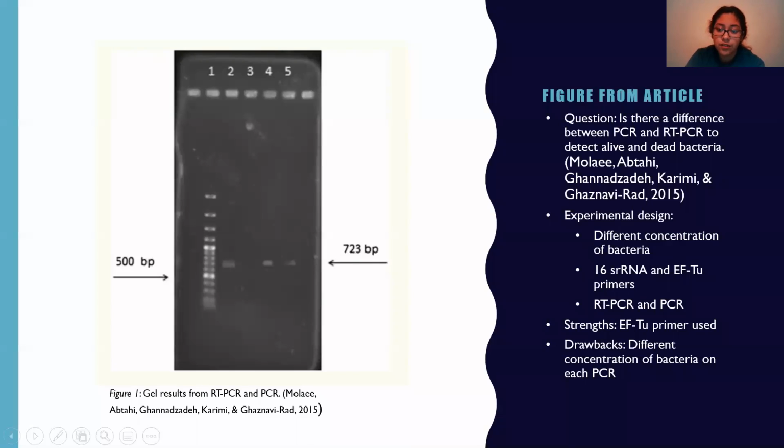This is a figure from the primary research article that I found, and the question that the authors were asking was if there was a difference between PCR and RT-PCR to detect alive and dead bacteria.